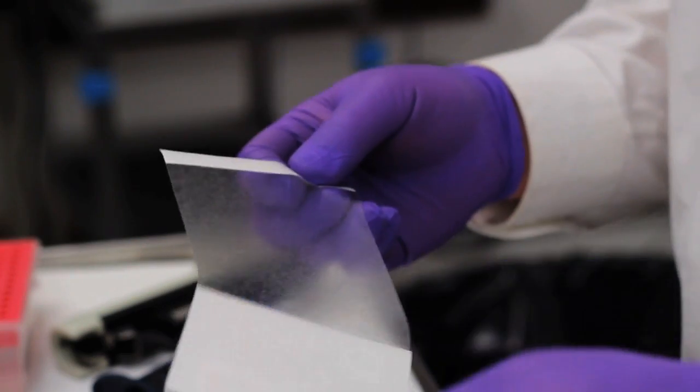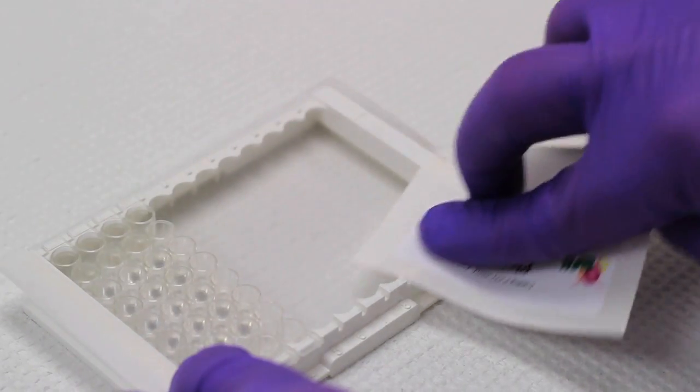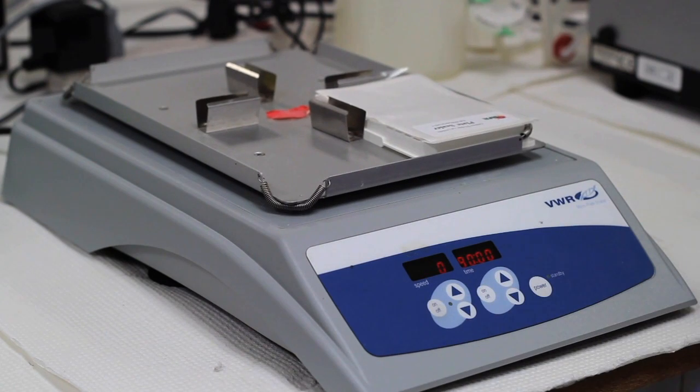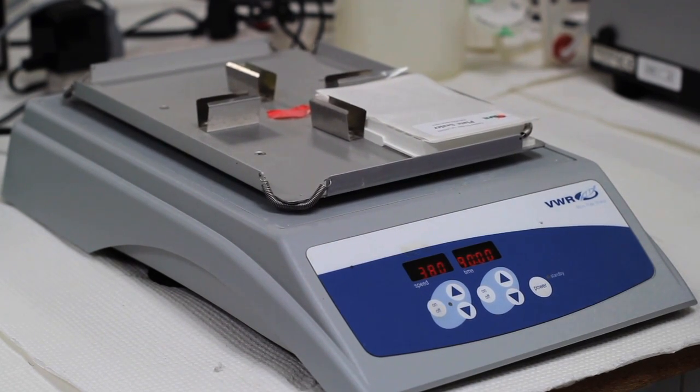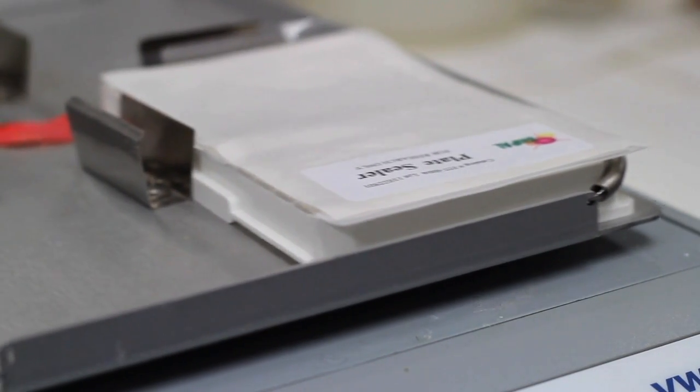Once all wells are filled, use a plate sealer to cover the plate and carefully rub it to make sure it adheres. Then place the covered plate on an orbital shaker at a speed of 500 and allow the plate to incubate for one hour. These parameters may vary based upon your equipment.